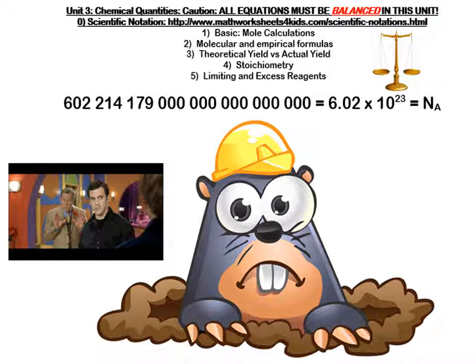In this video, we're going to take a look at how to find formulas for a variety of compounds by experimentation. So far we've been studying molecular and empirical formulas, and we kind of just told you, by experiment we figured out that there were so many grams of this element and so many grams of that element. But now we're going to see what actual experiments are done in order to do that.